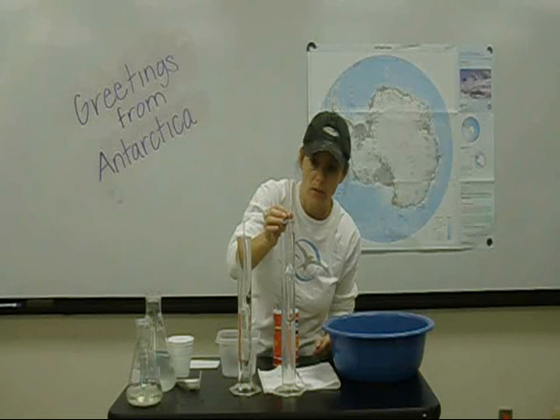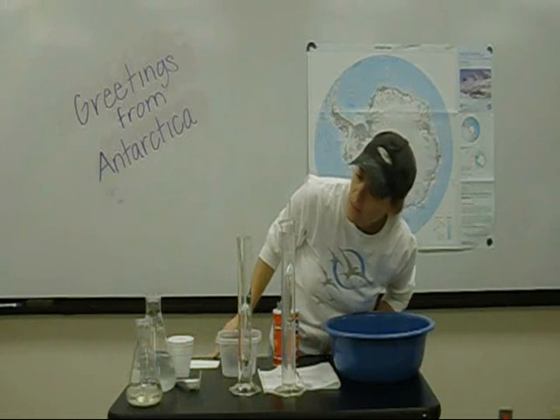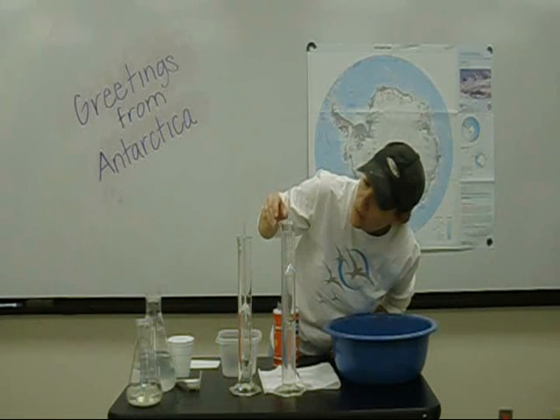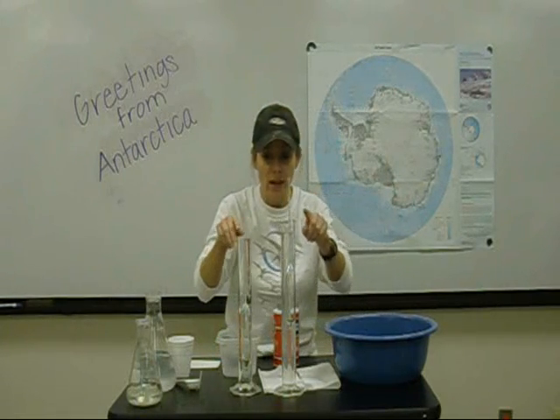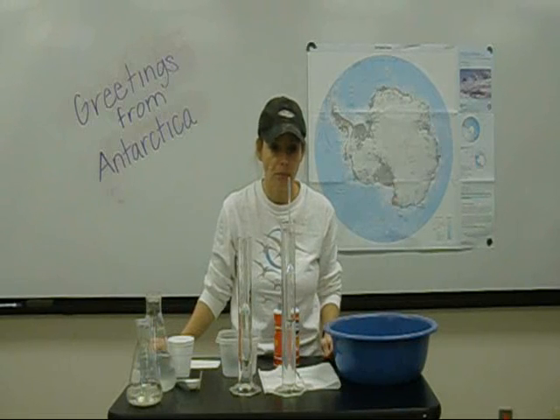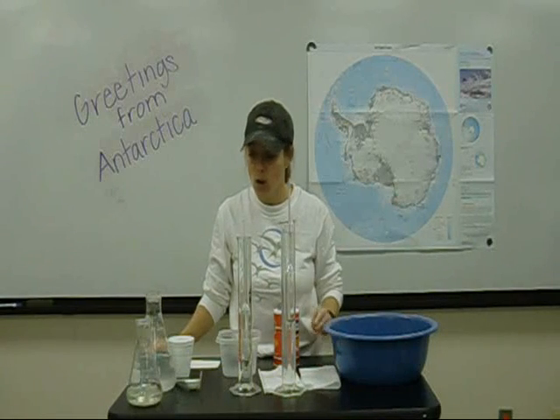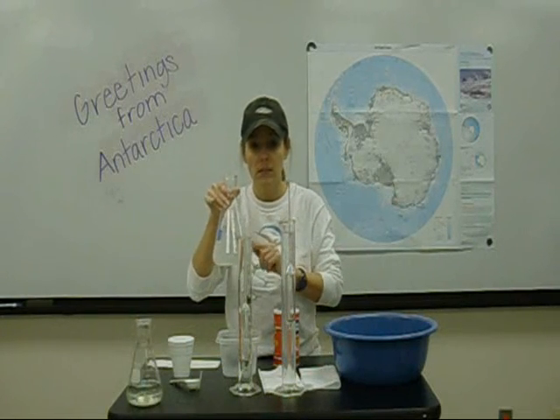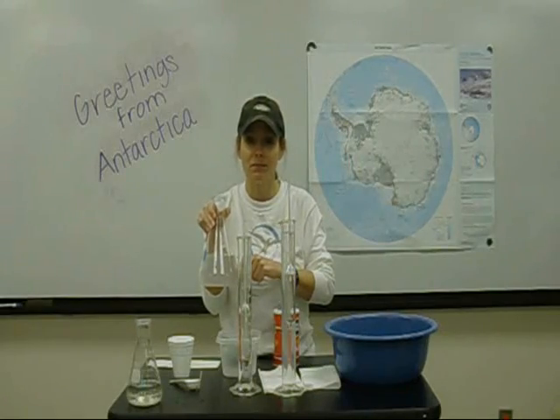Look at that, it keeps bouncing up. I'm going to try and settle it down here. And it is 1.025. So you can actually see that there's a significant difference there. Okay, so now we're going to place our saltwater solution in the freezer and see what happens. So stay tuned.